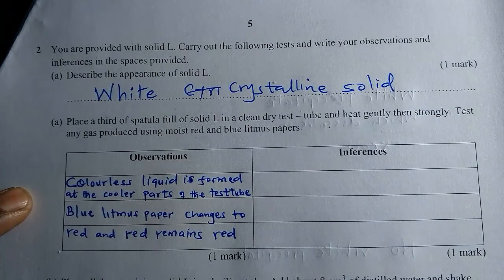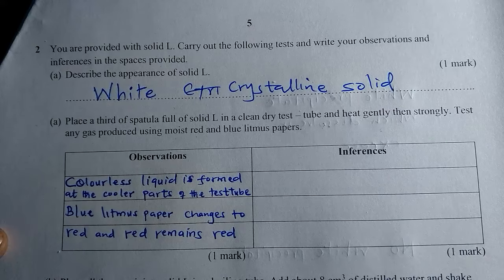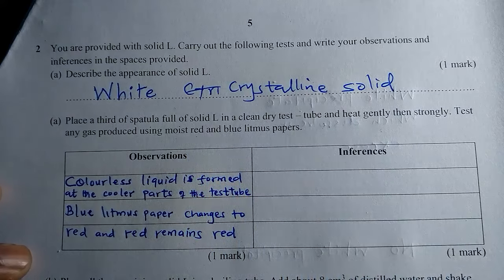Put the blue litmus and red litmus paper at the mouth of the test tube before you start heating. Otherwise, if you heat then put the litmus paper, you are doing useless work. You put the moist blue and red litmus paper on the mouth before you heat.